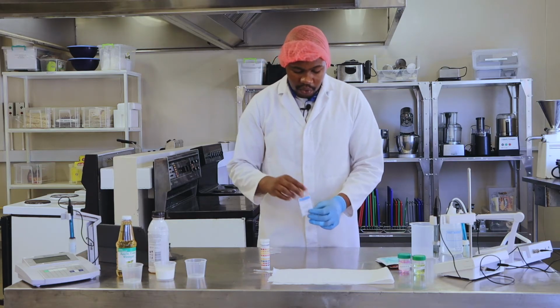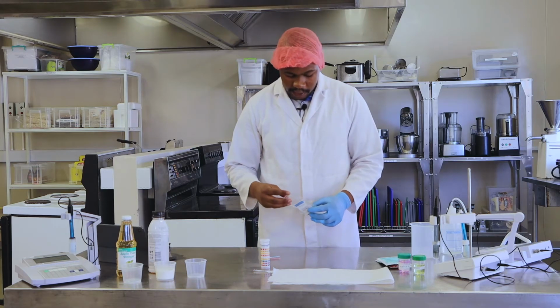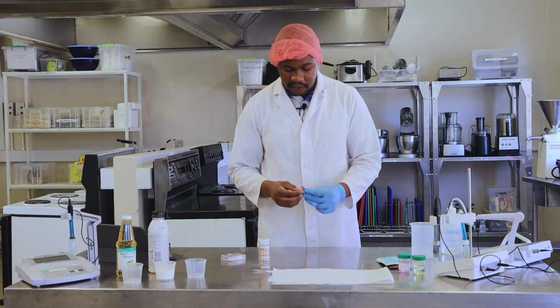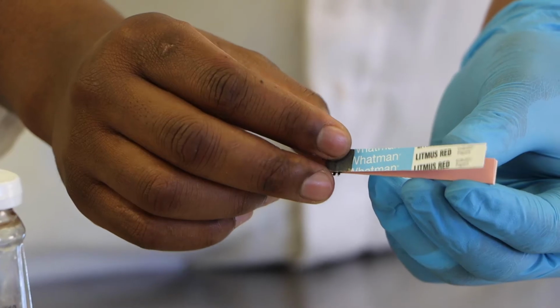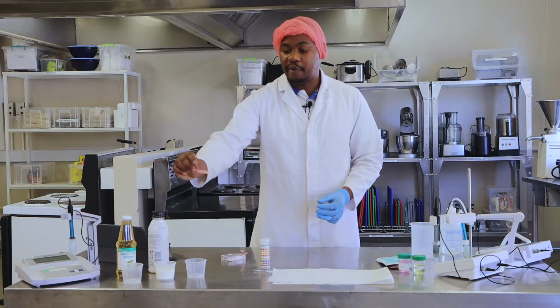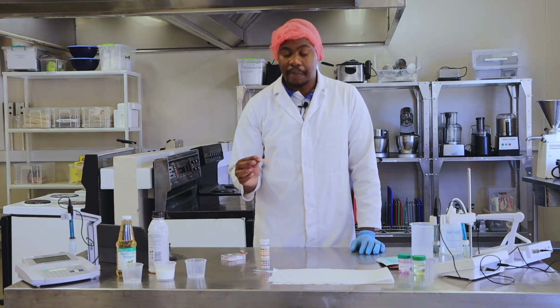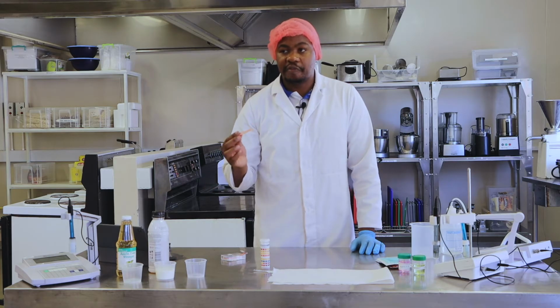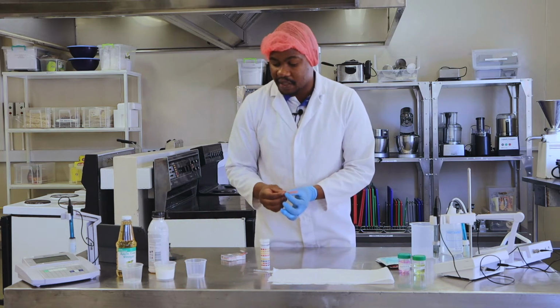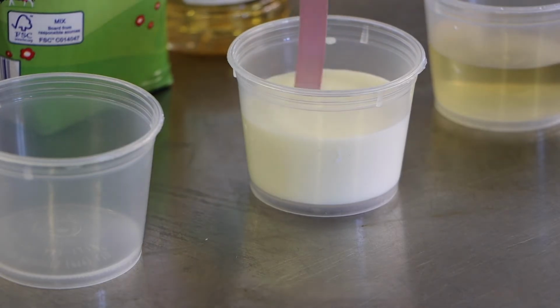So here I've got what we call litmus red. If you were in chemistry class in high school, you would know that there's also something called litmus blue. This is basically a strip of paper that you can use to do your analysis, and it is very simple. If I want to measure the pH of milk, I will just immerse the strip into the milk. So here I've got milk.